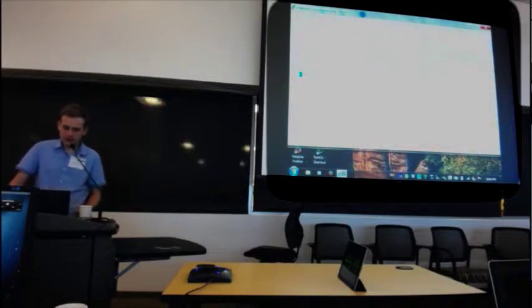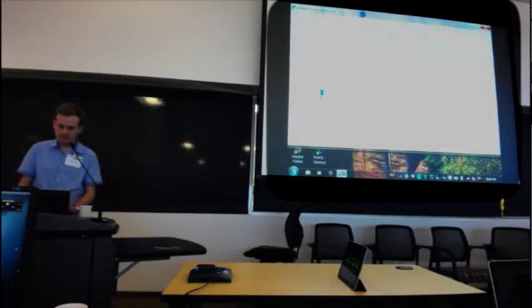Okay, so we have now edited the convert config file. Let's see how the queue is doing. If you still haven't issued this command, it will be very helpful if you do, bkill 0, because otherwise the queue will be clogged very quickly.